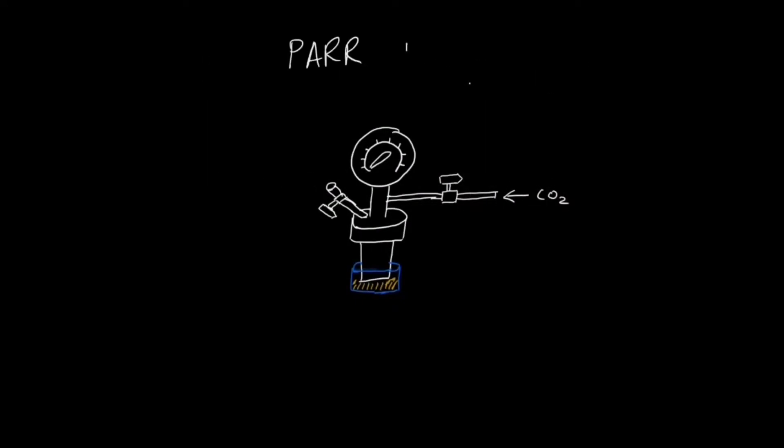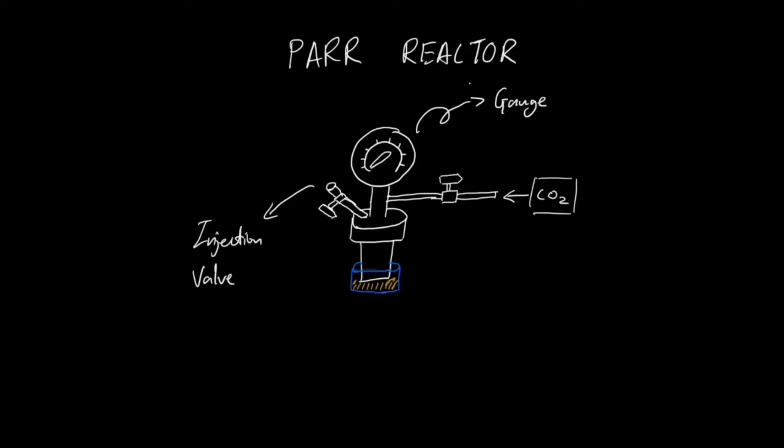How to set up a Parr Reactor. A Parr Reactor is used to conduct reactions with gases at high pressure. It contains a gauge to measure the gas pressure, an injection valve, and a vessel. The gas valve is used to control the amount of gas entering the system, and a sand bath is used for heating up the Parr Reactor.